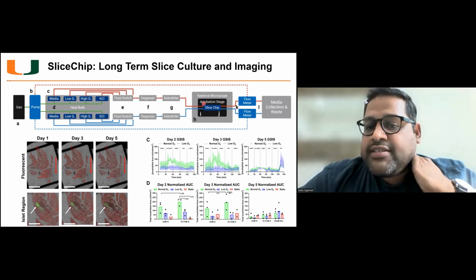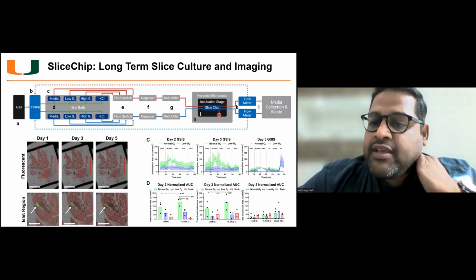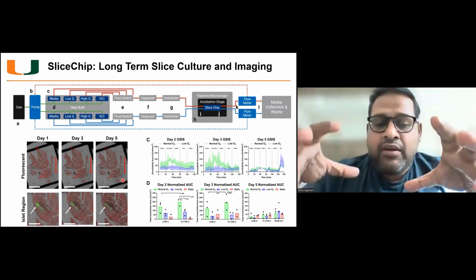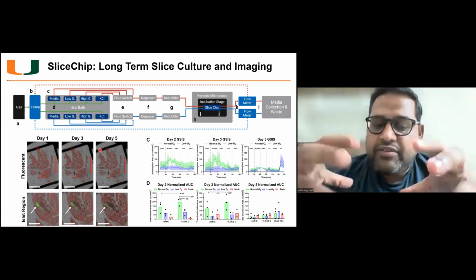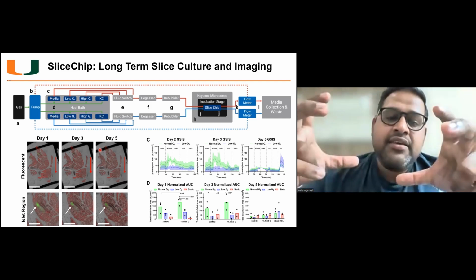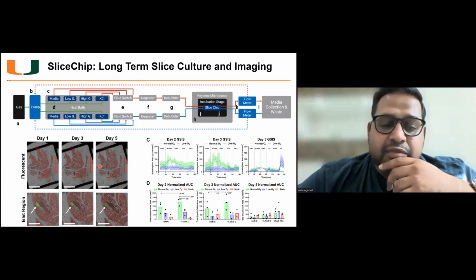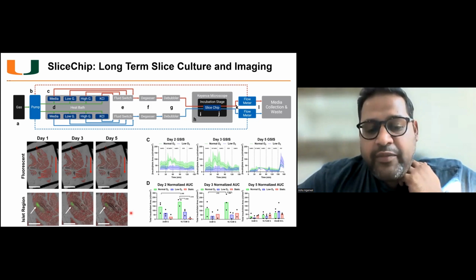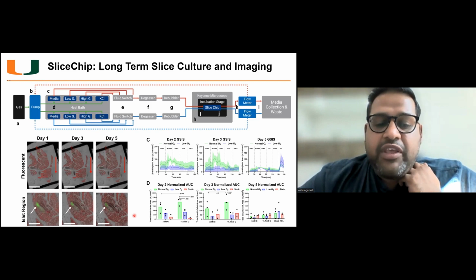And the slices, pancreatic slices, would sit in the microscope for their entirety of multiple days. And you could image each of those slices. Even with perfusion, they wouldn't move because we created anchors, these 3D printed stainless steel anchors that wouldn't interfere with imaging, but would sit on the outside, the periphery of the slices, so that the slices were held down by these anchors. And so you could come in and do high mag imaging. For example, in this case, these were slices not from a human, but from a mouse where insulin positive areas were GFP positive. So the same GFP positive area could be imaged over time.